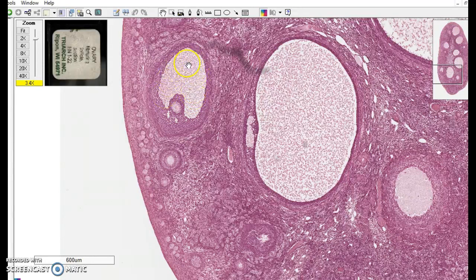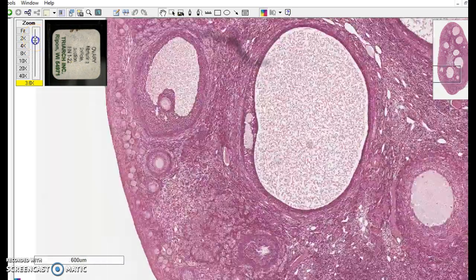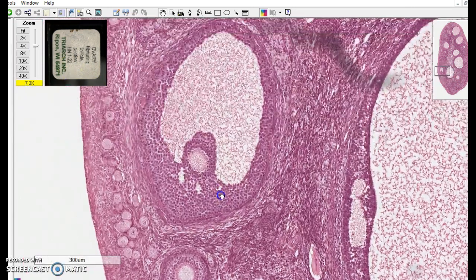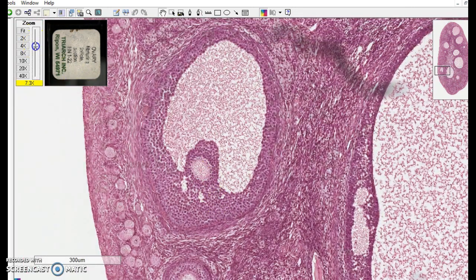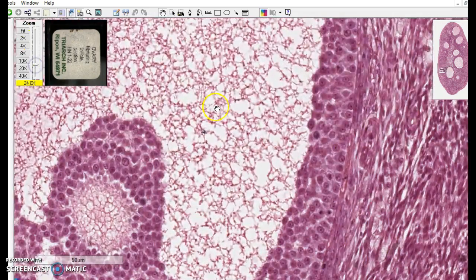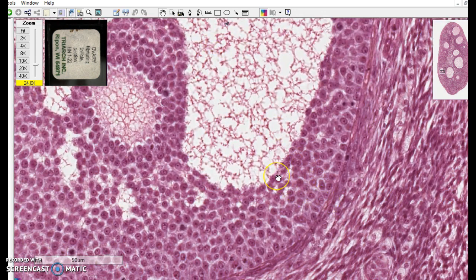This stuff that is filling the space, here's some over here and this is here, that is liquid. It's referred to as an antrum. So here's the basement membrane. And these are stacks of cuboidal cells that produce female hormones. And here we go. This is the egg. These cells constitute a stratified cuboidal epithelium.